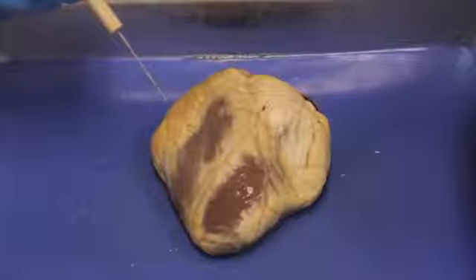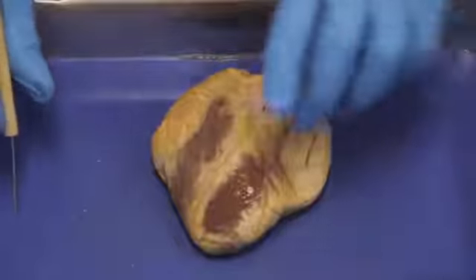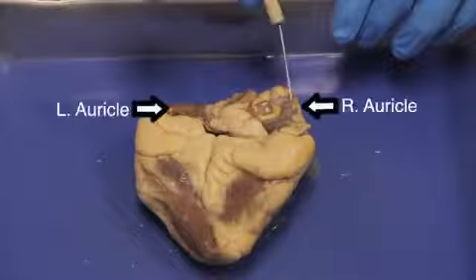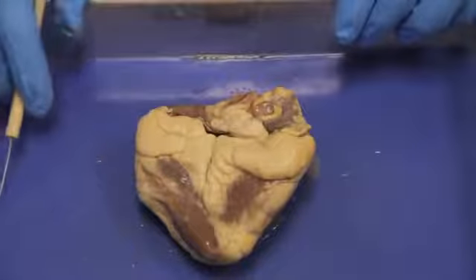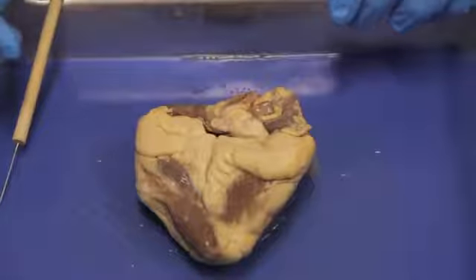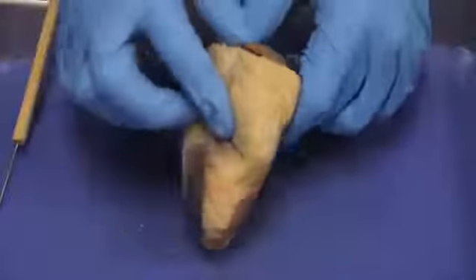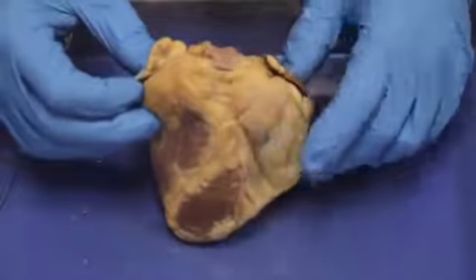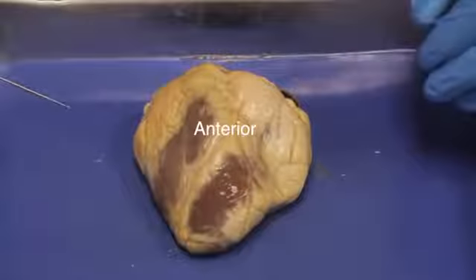The second external features we need to find are the left and right auricles. These are the auricles here, this and this. But in order to find the anterior side, they should be peeking around the corner like ears, because in Latin, auricle means ear. Here they're not peeking around. So let's take a look at the other side and we can see the auricle is peeking around there and peeking around here. So this is the anterior side.